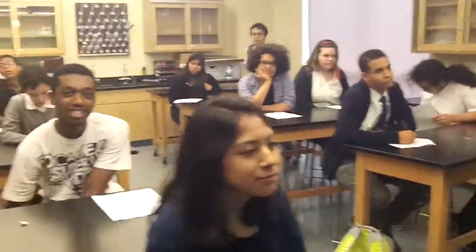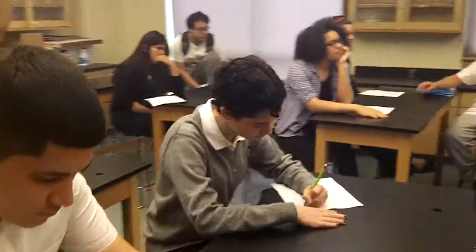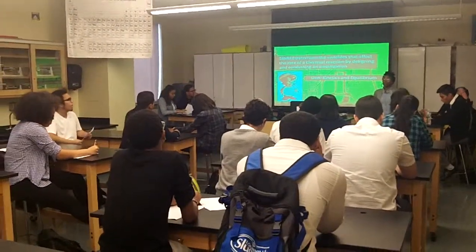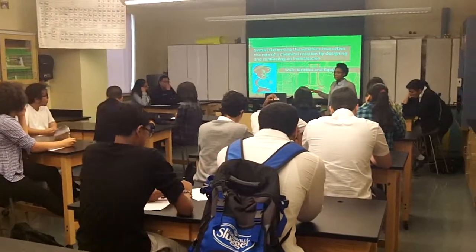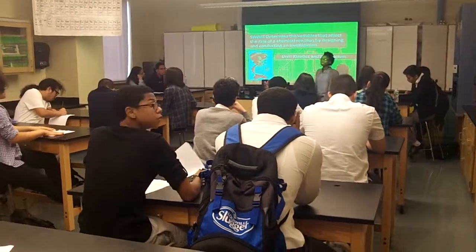All right, today, class, we are going to be diving into true science, okay? Today is true science. Now, for today's class, I need somebody with a big voice to read today's objective. Dio, go ahead and take that bag off while you're at it. Students will be able to determine the variables that affect the rate of chemical reaction by designing and conducting an investigation. All right. Now, true science is all about making a prediction based off of what you see in the world, and you can see if your prediction is correct by testing it through an experiment. So today, you guys are going to design your own experiment.